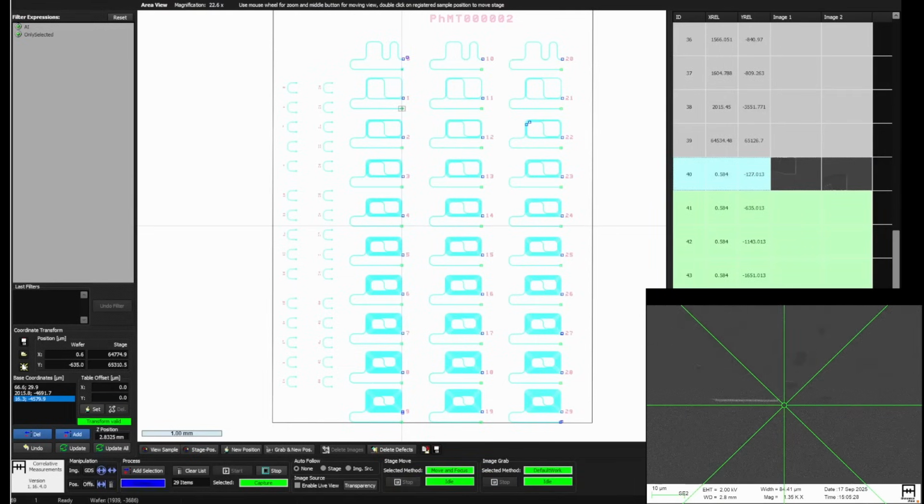and then going to the next position, overview image, first position correction, second position correction with autofocus, and after autofocus, first corner and second corner. So you could see this was quite easy to create such an already relatively complex recipe with one reference point, a focusing action, a refine action, and then imaging at different positions.